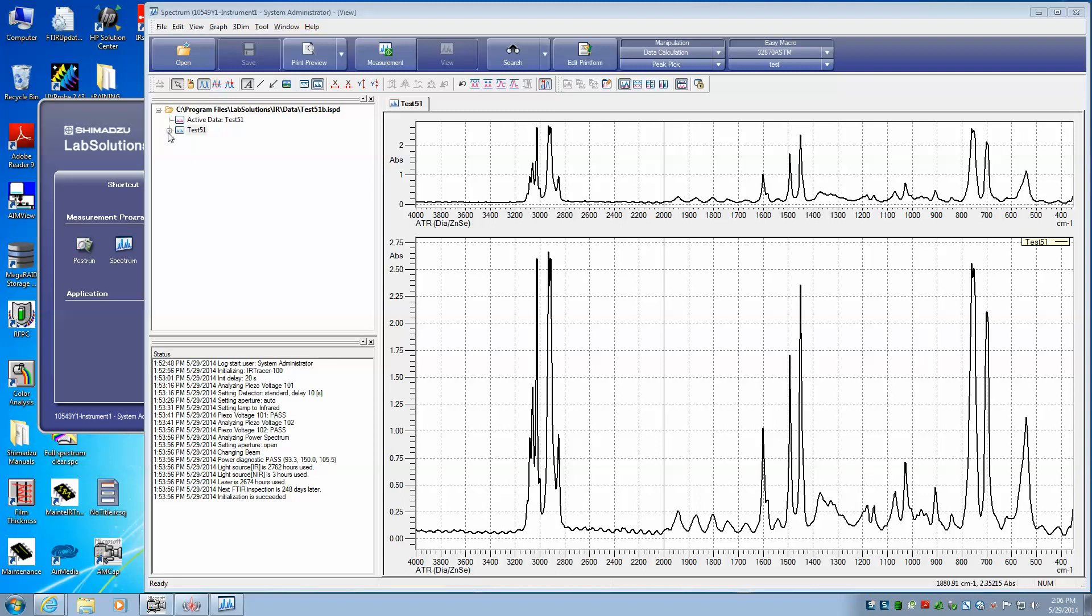Okay, now we have our sample, test 51, the one we just acquired, the polystyrene, loaded.